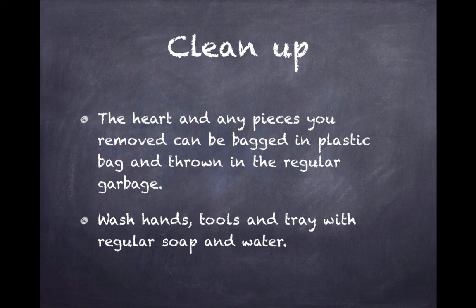Again, just a reminder, as you clean up, any heart and pieces you've removed can be bagged in a plastic bag and thrown in the regular garbage. Wash your hands, tools, and tray and keep them for later.